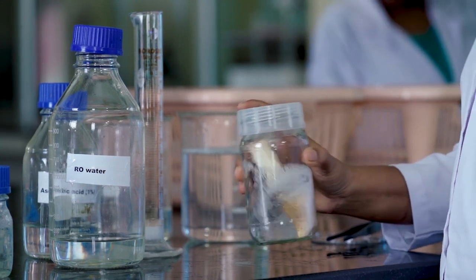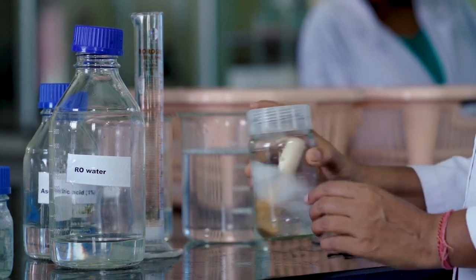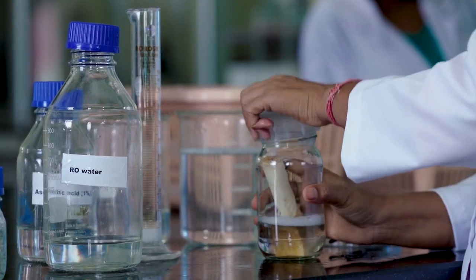The explant is treated with ethanol for a few seconds to minutes to prevent any contamination.